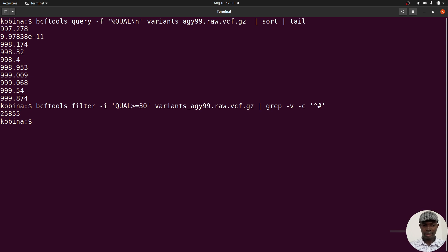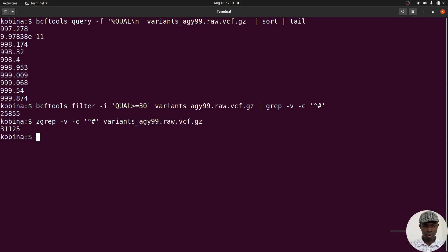Now let's count the total number of variants in the file using zgrep -vc '^#' on the raw VCF file. Comparing the two counts: the total number of variants versus those with quality >= 30 shows a reduction of over 6,000 variants. These filtering steps are what you do after calling variants — this is how you get your high-quality variants and then proceed with downstream analysis.